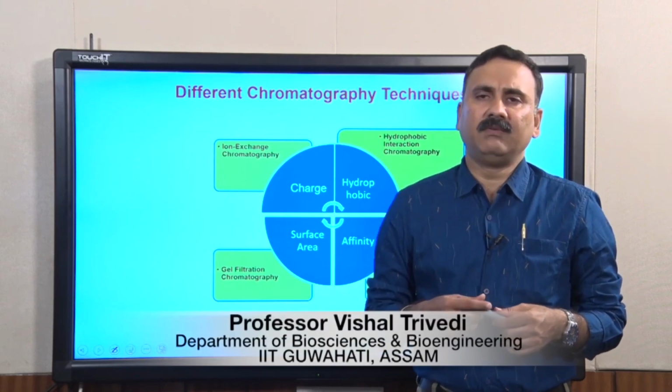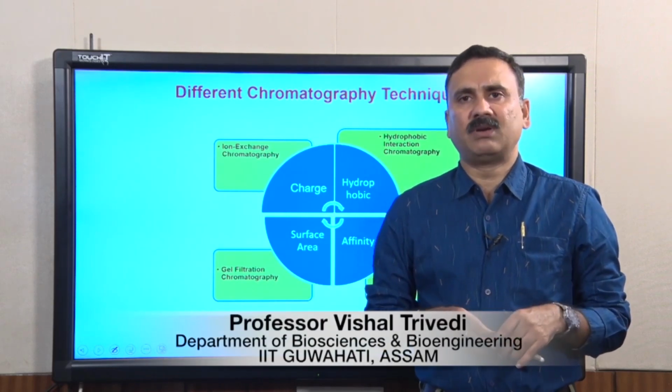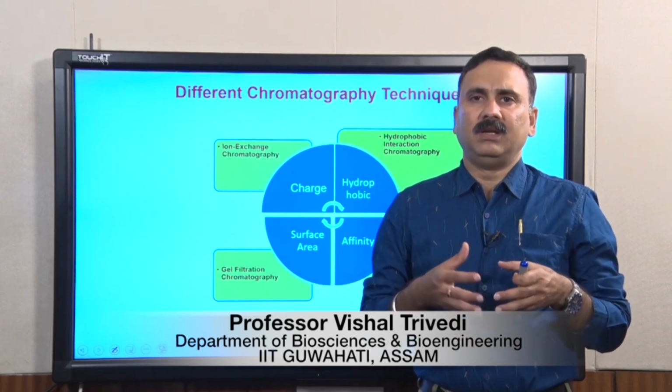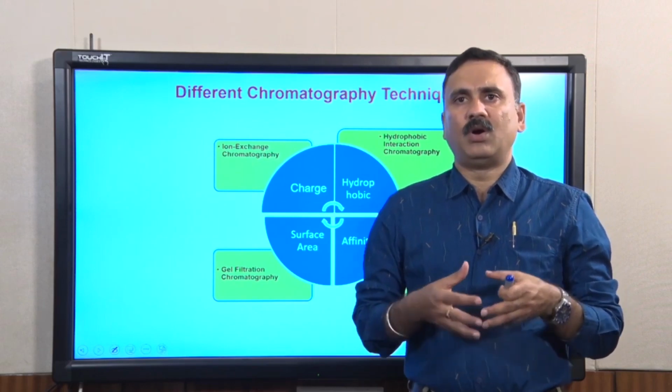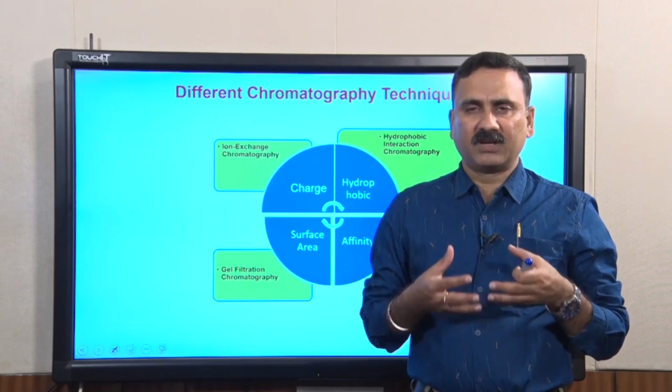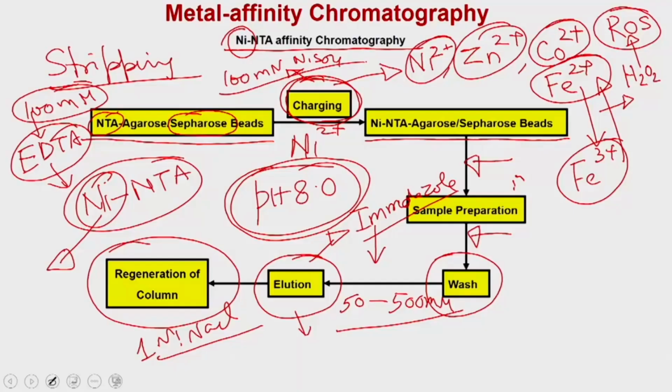And what we were discussing about the different chromatography techniques which people are using to purify the protein or the other factors from the cells where they are overexpressing these components. Now, how to perform this affinity chromatography in your laboratory?